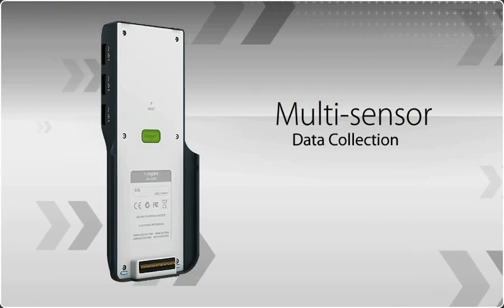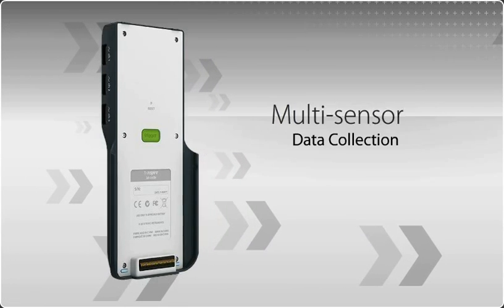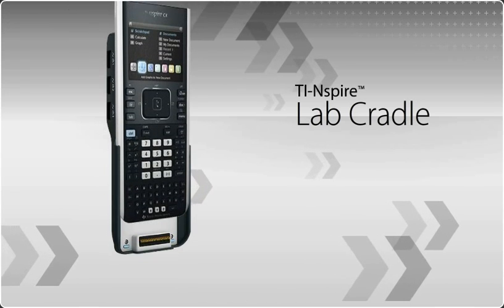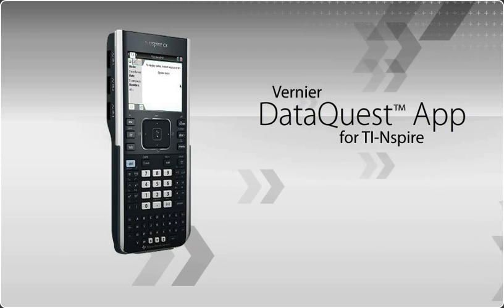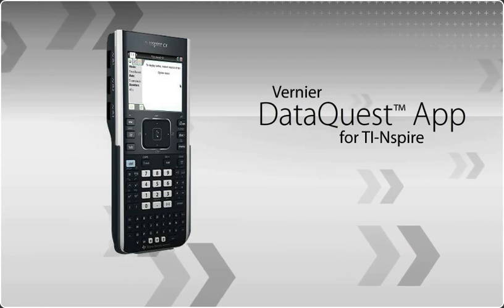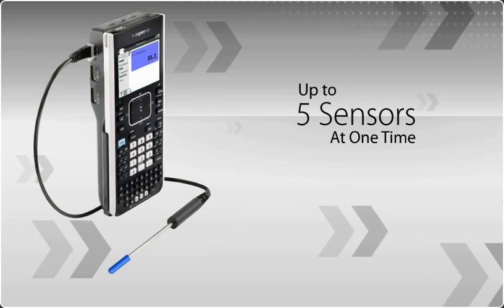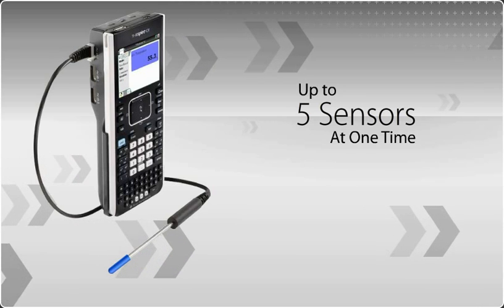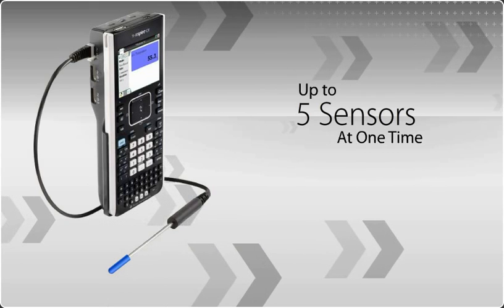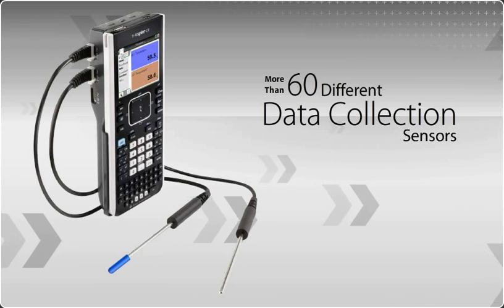Multi-sensor data collection is just as easy and just as engaging with the TI-Nspire lab station. To get started, just slide the TI-Nspire lab cradle onto the TI-Nspire CX handheld. The Vernier DataQuest app for TI-Nspire, built into the TI-Nspire CX handheld and computer software version 3.0, auto-launches instantly. Connect one, two, or as many as five individual sensors at one time for multi-sensor, high-sample rate data collection and analysis. The TI-Nspire lab station accommodates more than 60 different TI and Vernier data collection sensors.